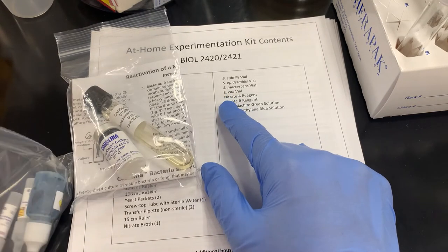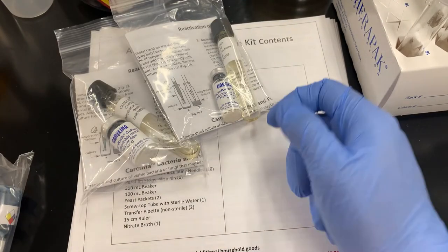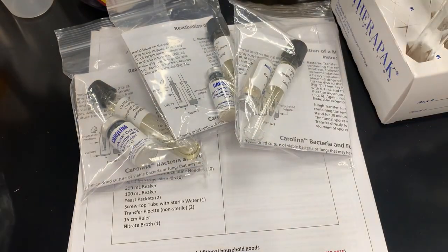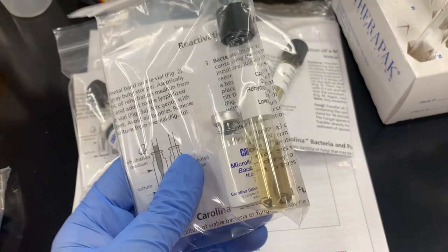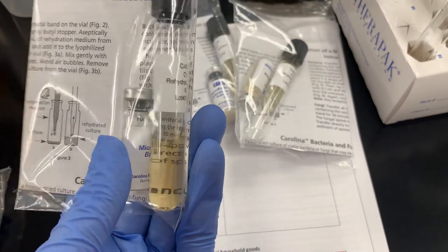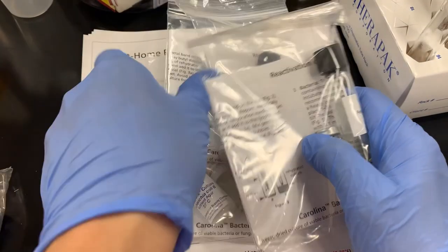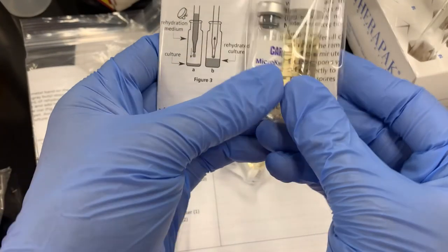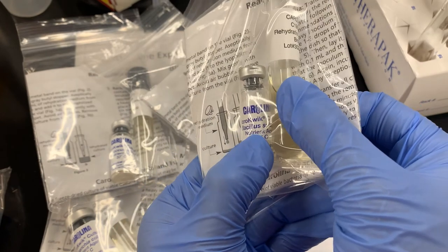Each of these is going to come in a little packet, okay? It's gonna come with rehydration nutrients. Your instructors are going to provide you with a video from Carolina about how to rehydrate your bacteria. And from there, you're going to streak plates and streak test tubes and all that good stuff. These are your bacteria. You get 4 of them. Now, please do this. Look and make sure that you have 1 of each.